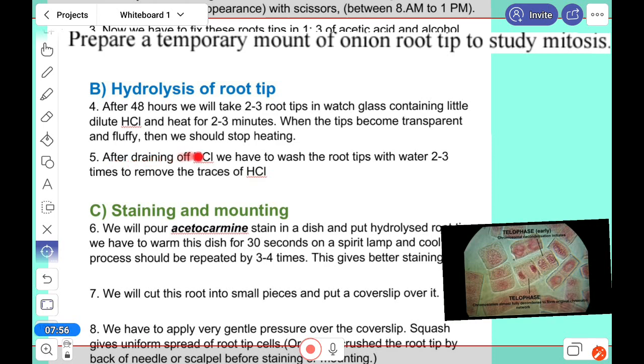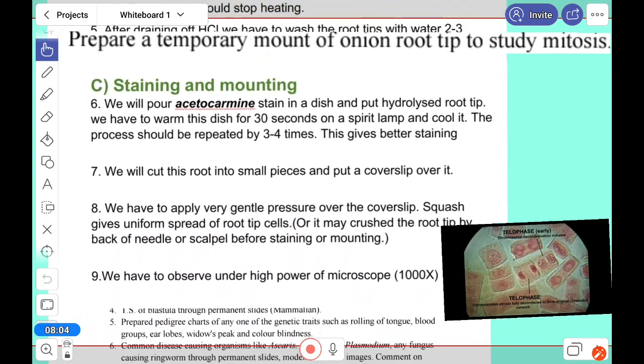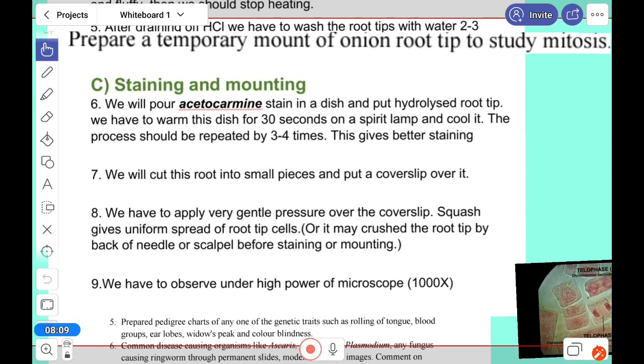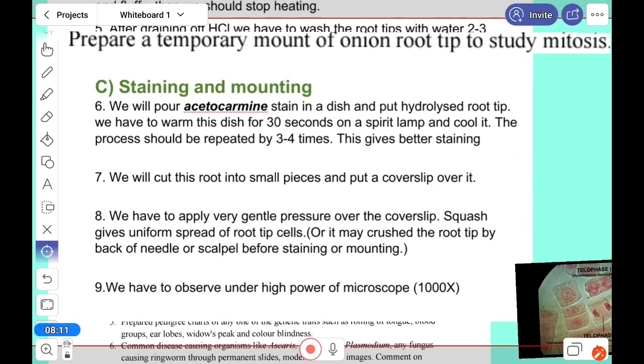After draining, we have to wash it and remove the hydrochloric acid. Now the staining and mounting part. Next, we'll pour the aceto-carmine stain in the dish and put the hydrolyzed root tip. Warm the dish for 30 seconds on the spirit lamp and cool it. We'll repeat this process three to four times for better staining.